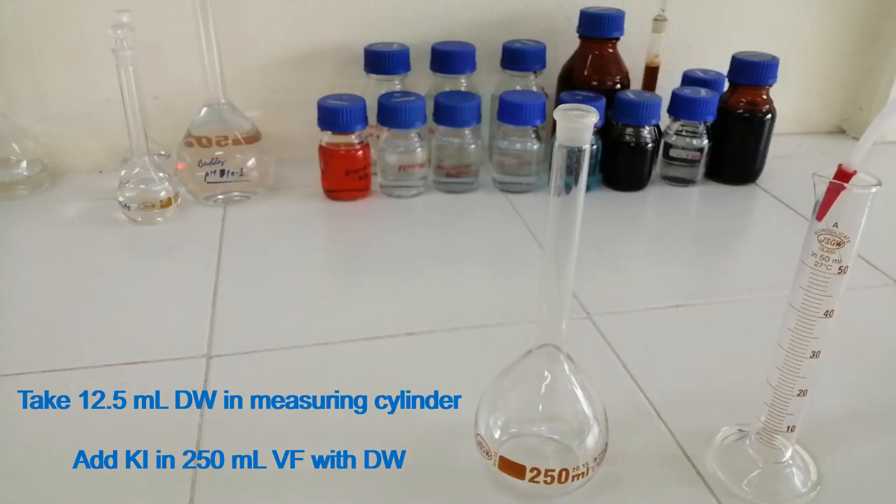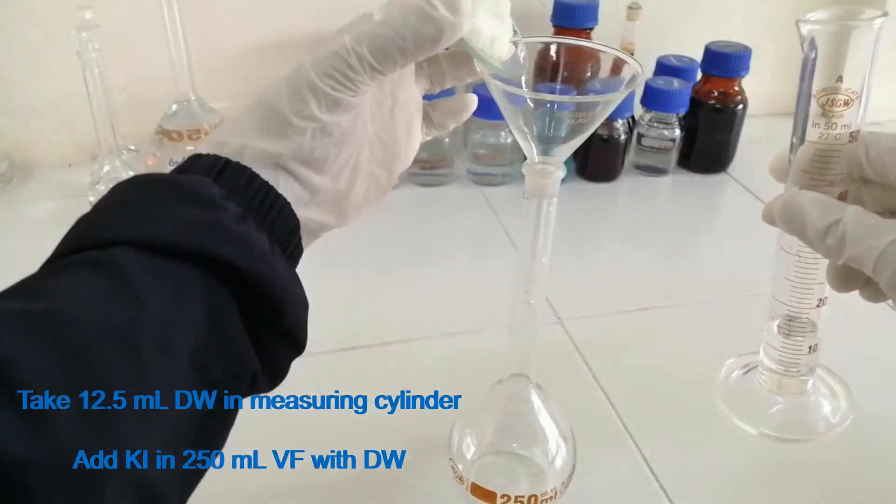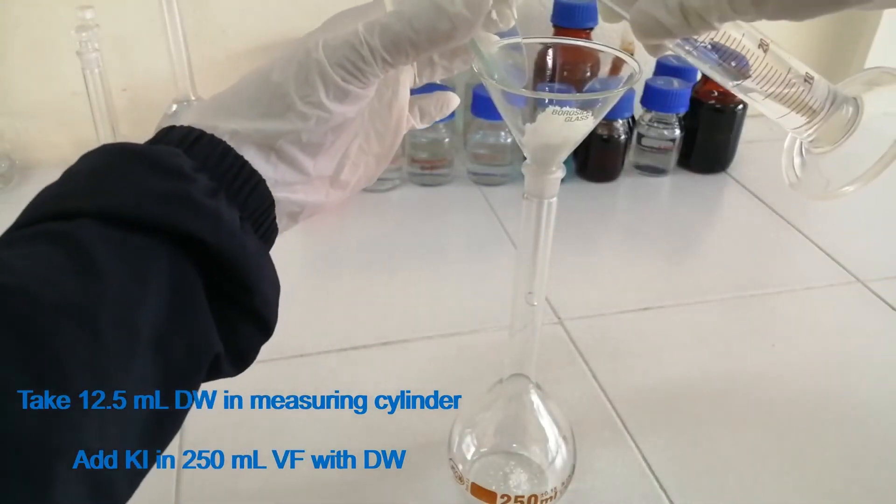Take 12.5 ml of distilled water in a measuring cylinder. Add potassium iodide into a 250 ml volumetric flask with the distilled water.